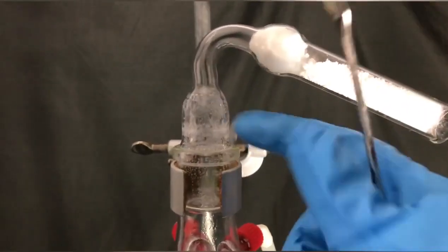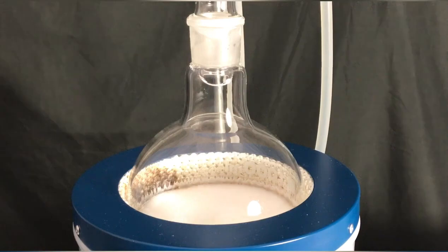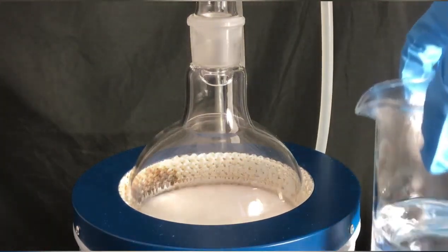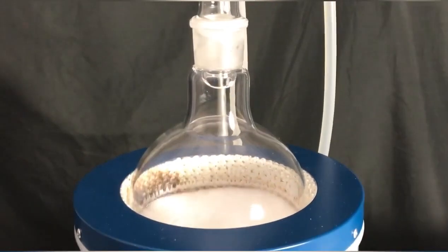What I found interesting was that after some time, what I guess was barbituric acid had settled on the top and on the bottom of the condenser. It's strange that no solid had settled on the walls in the middle of the condenser, but only on the top and on the bottom.